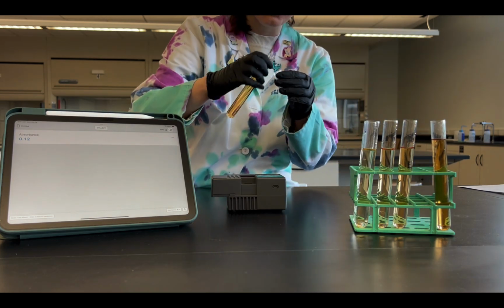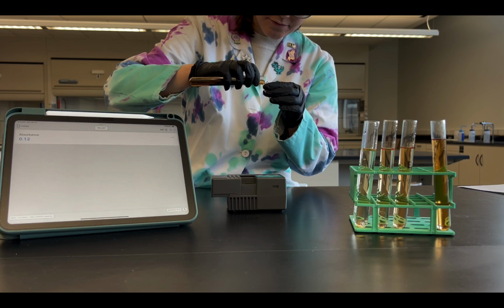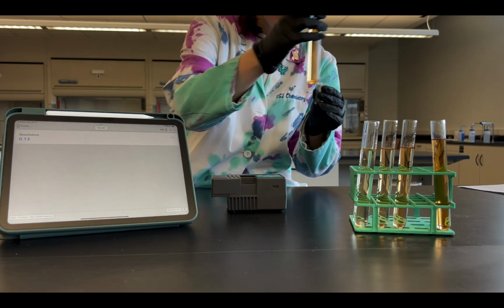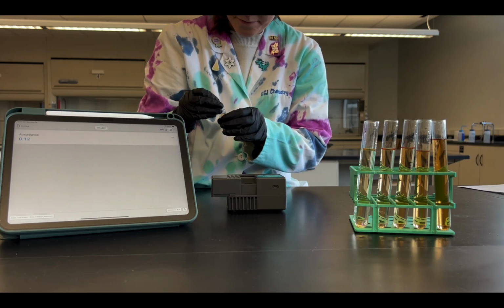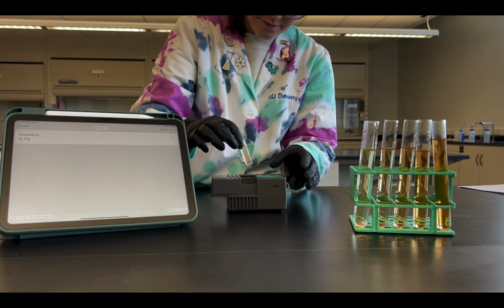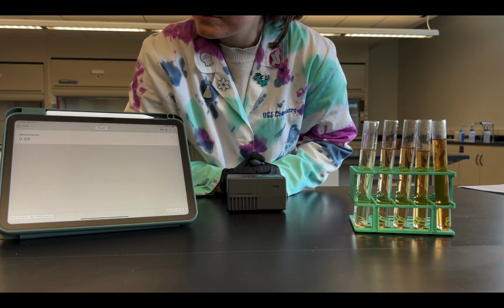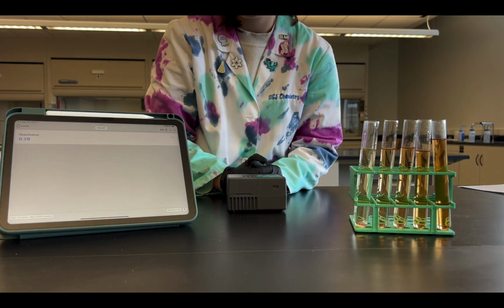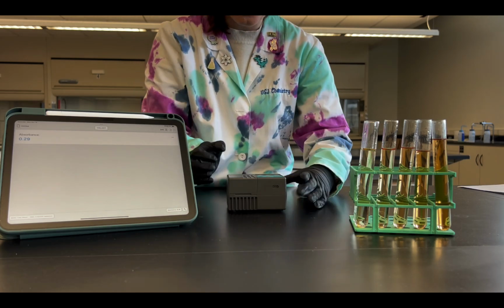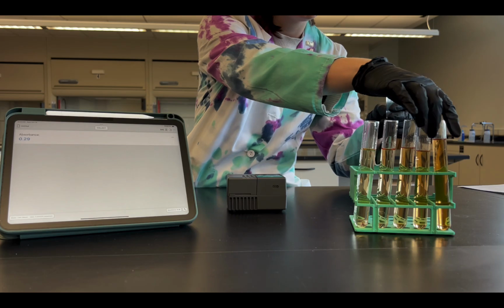We have 2 more test tubes to do. It goes again. Now it's that much higher, 0.30. And we'll go into our last test tube.